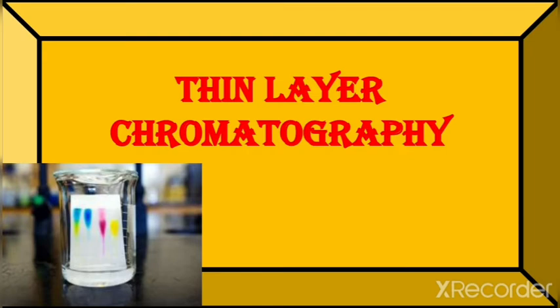Now in this video lecture we are going to understand thin layer chromatography with respect to its definition, its different types, its different mechanisms, how it works in the lab and how we can perform it in the lab, and at the end we are going to discuss how we can observe and how we can do the result analysis in the lab. So let's start our lecture.